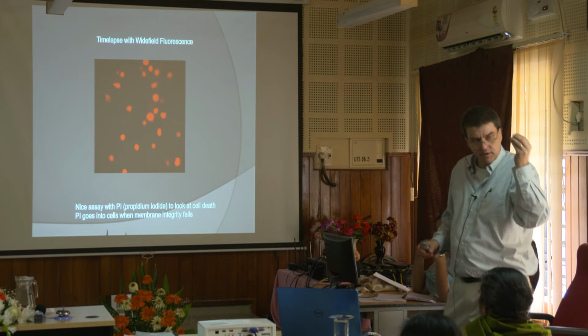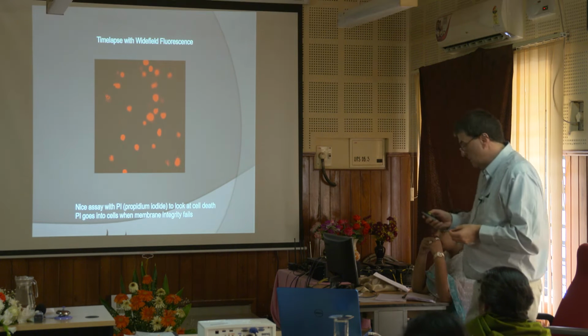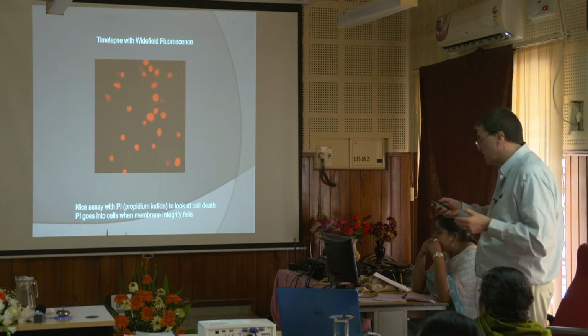Okay, so again, the motorized stage is really nice for something like that. It lets you do a time lapse. And nothing like a movie to show what you're trying to show. It definitely helps.